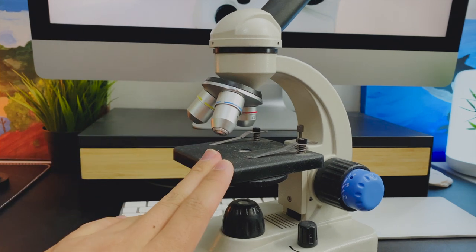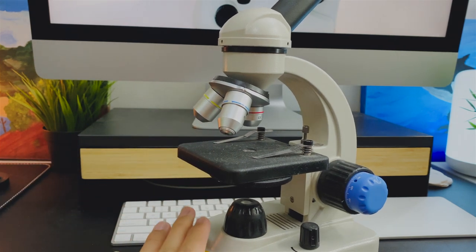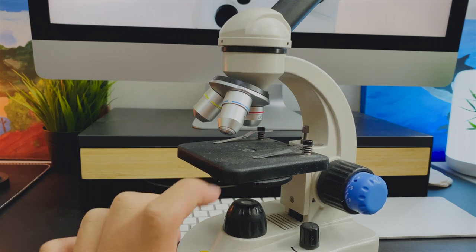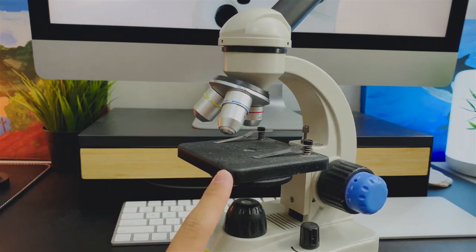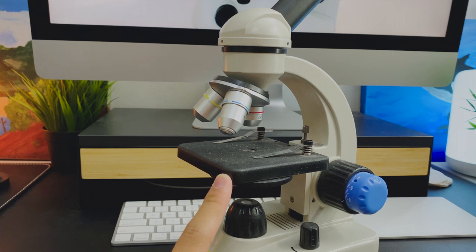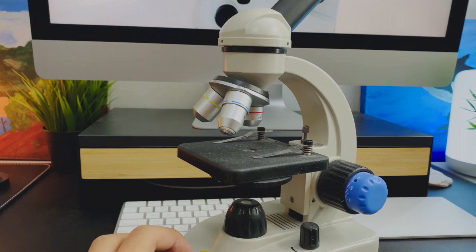One of the features that's missing from cheaper microscopes like the Swift is the mechanical stage. Mechanical stages are used to adjust the position of your slide. Without it, you need to use your fingers to do that and it's not as accurate.